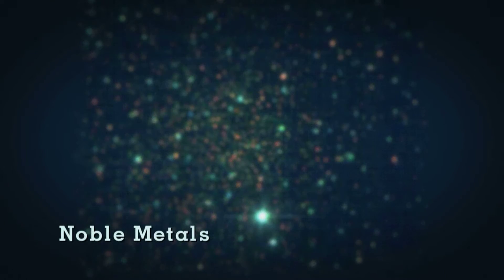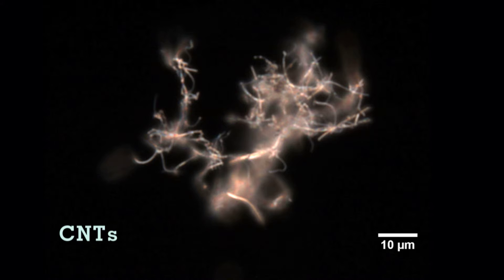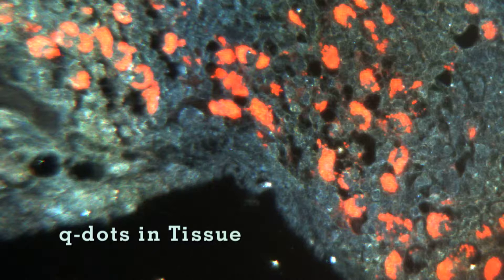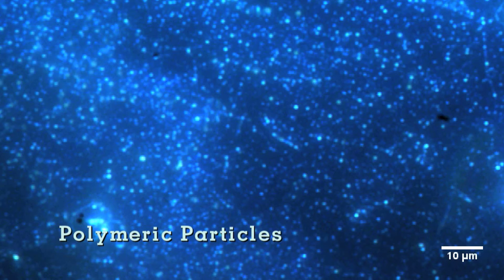Nanomaterials that can be characterized with CytoViva include noble metals, carbon nanotubes, quantum dots, and polymeric particles.